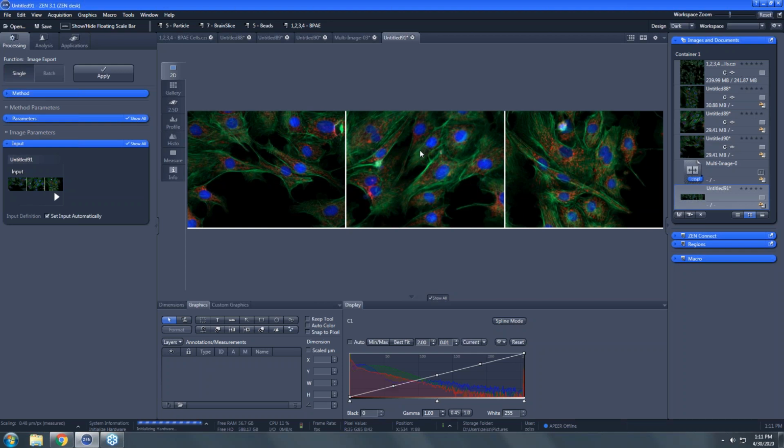When I drop these into PowerPoint, you can, of course, just save it as a JPEG, but I'm even lazier. I just use the Windows snip tool. So if anybody listening is not using the Windows snip tool, it's definitely worth exploring. It's a screen capture device, and you just kind of drag, and it saves even that step of saving a JPEG and then importing it, because it copies and pastes the image on the screen more or less.